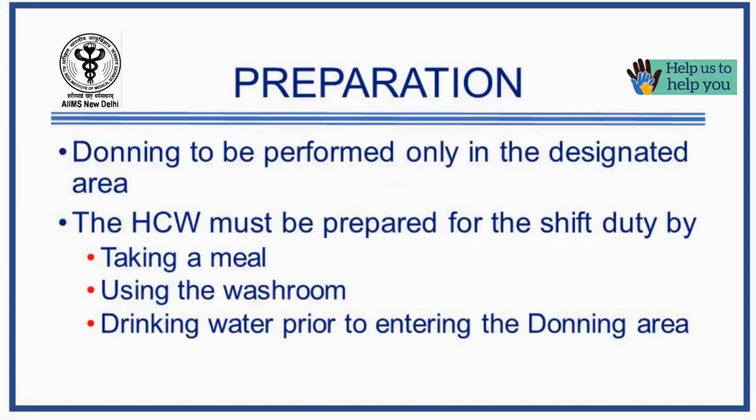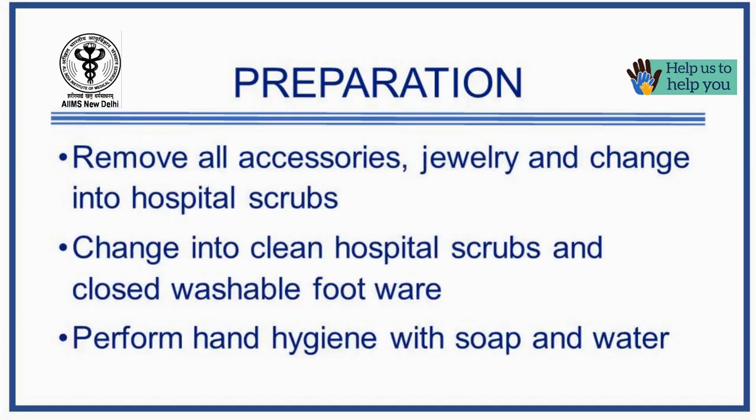Donning or wearing the personal protective equipment must be performed outside the COVID ward in the donning designated area. Healthcare workers must take a meal, go to the washroom, and drink water prior to entering the donning area. Remove all accessories like jewellery, watch, wallet, mobile phones, etc., and change into clean hospital scrubs. Wash your hands thoroughly with soap and water.